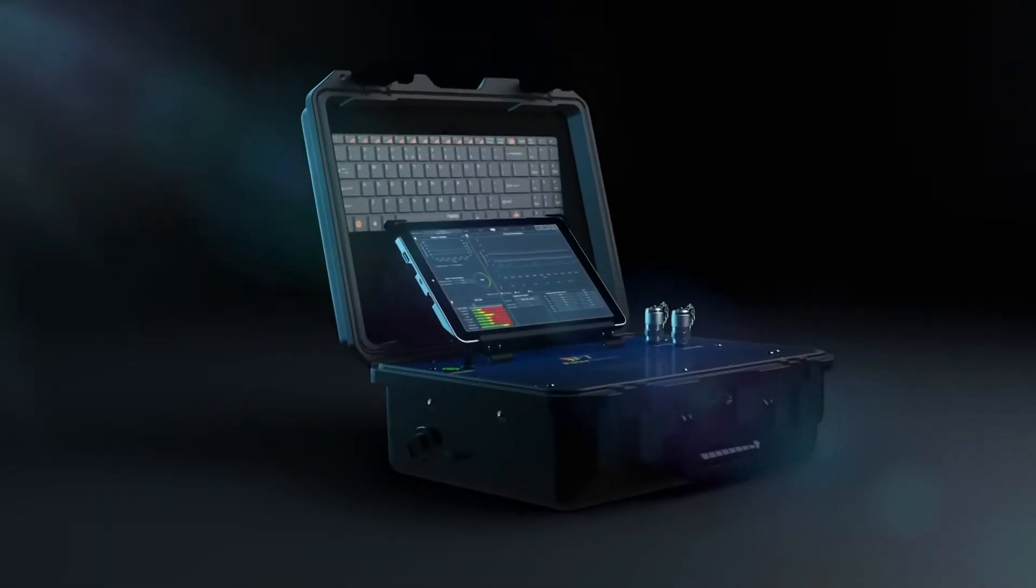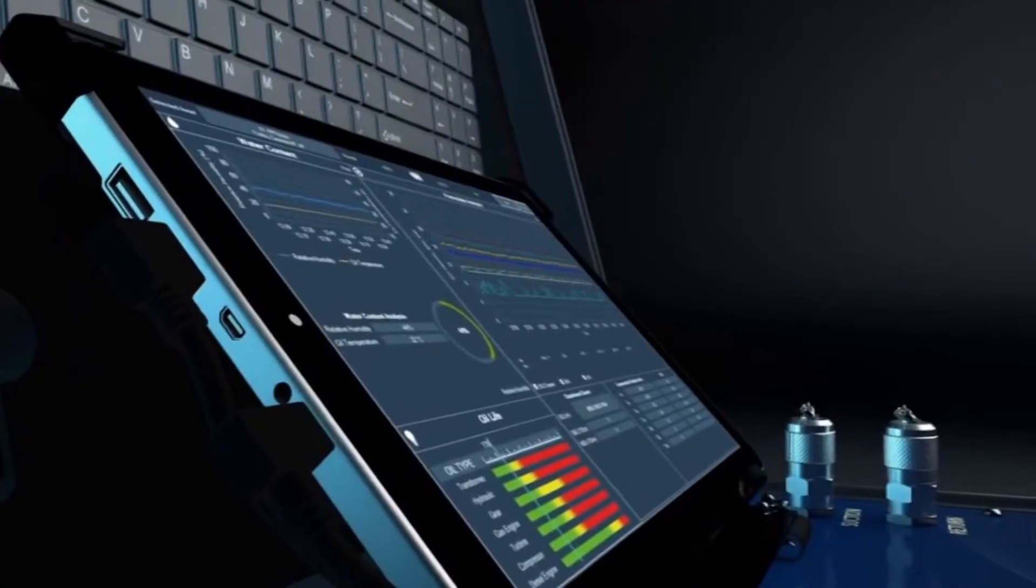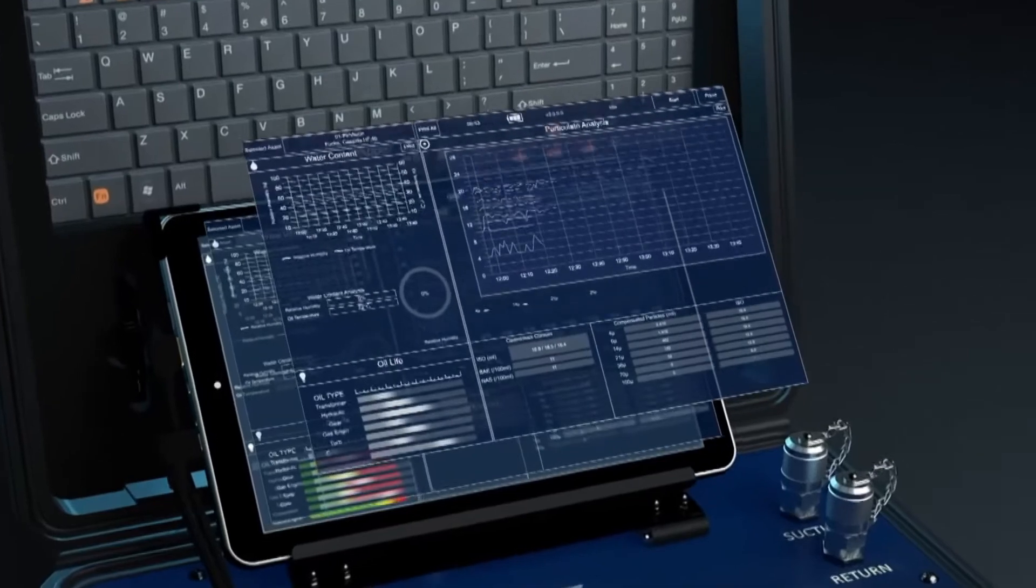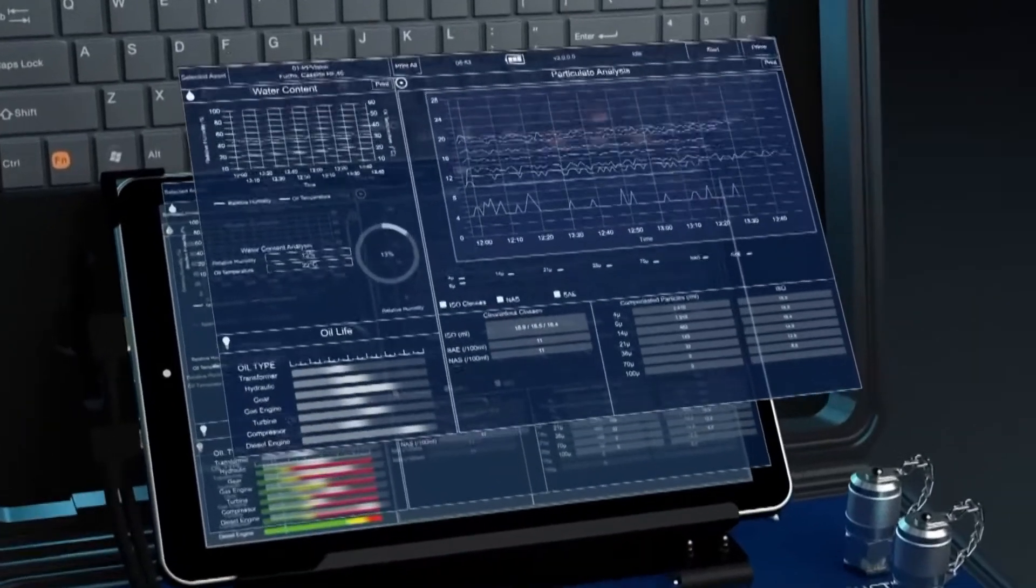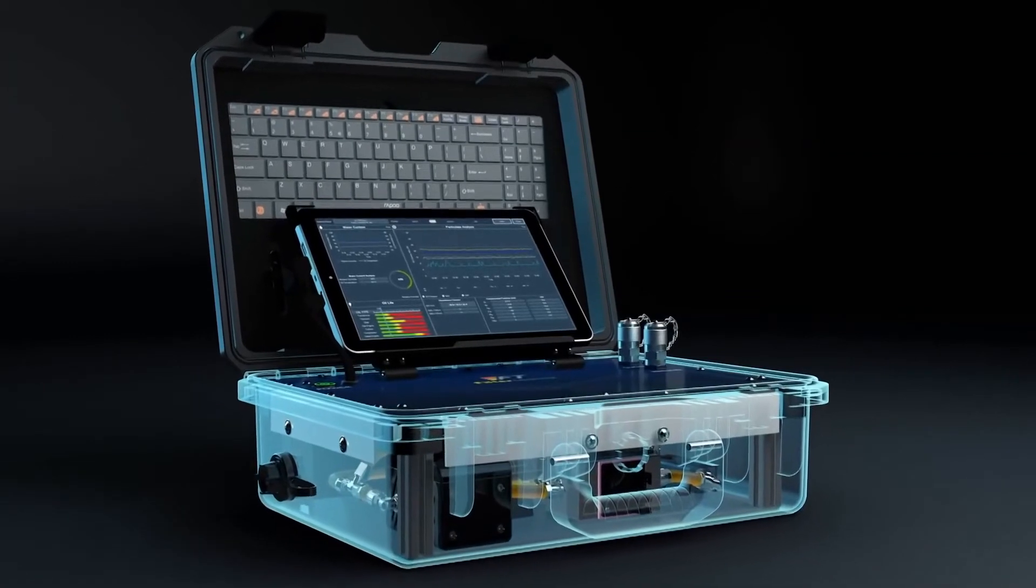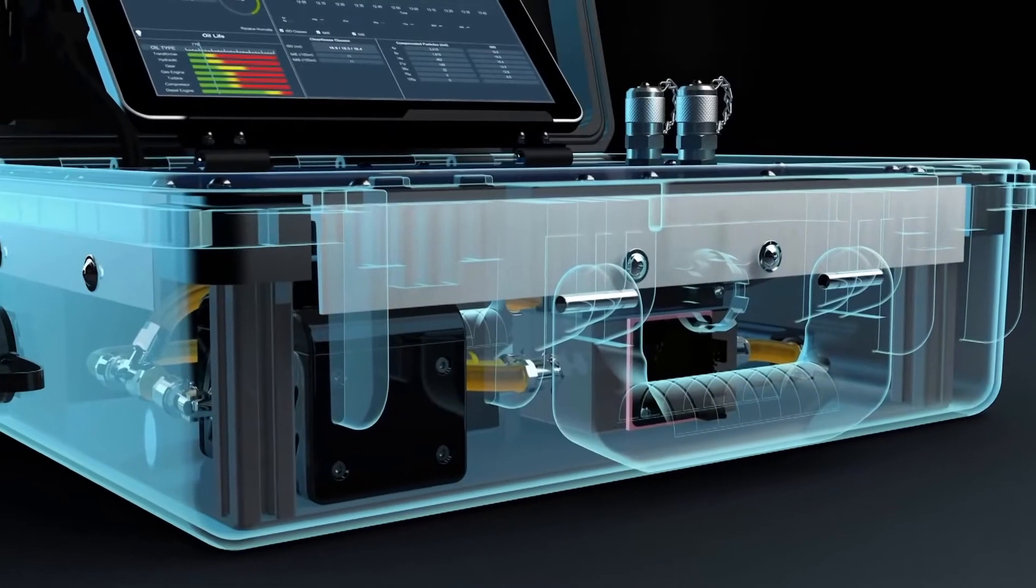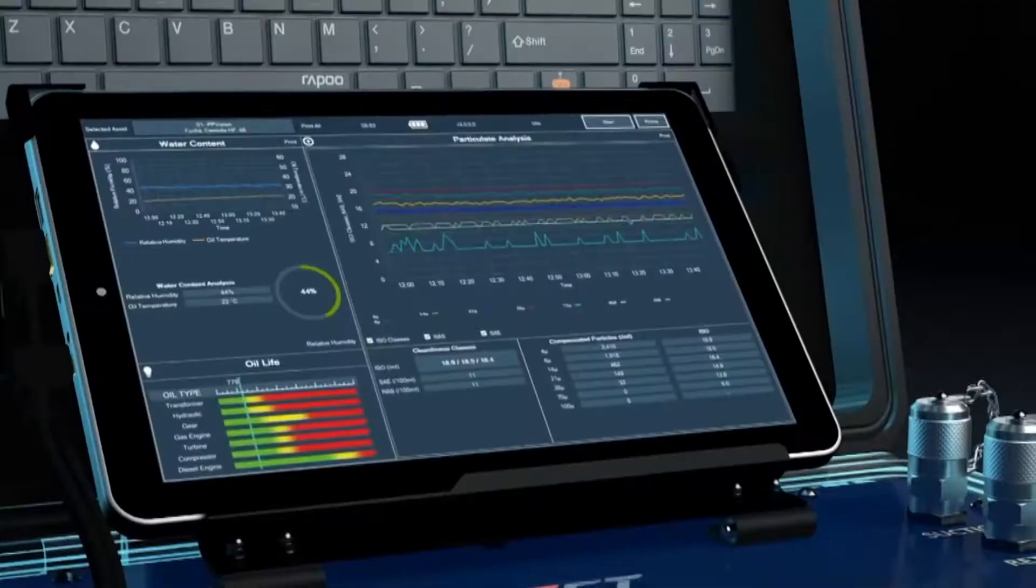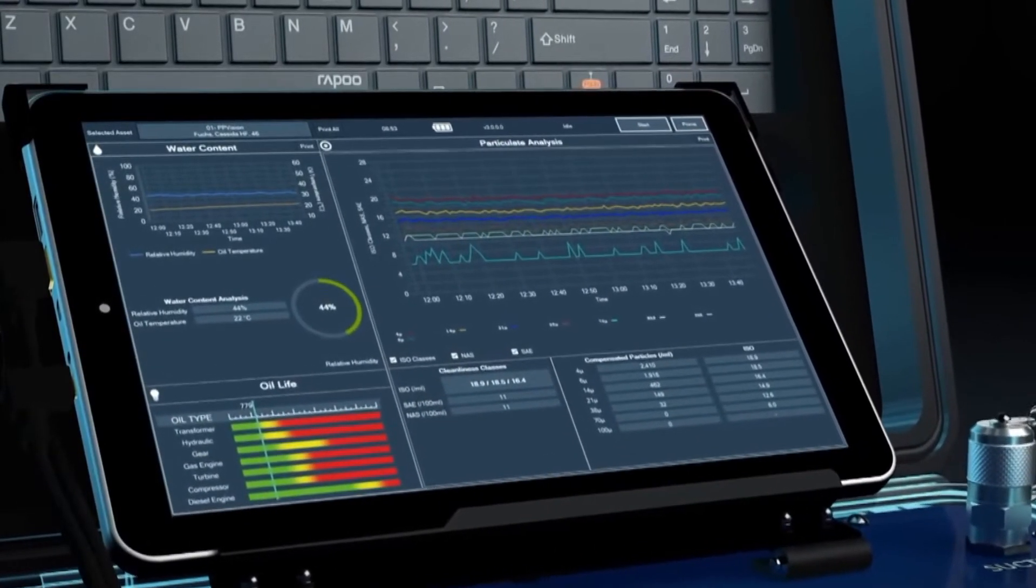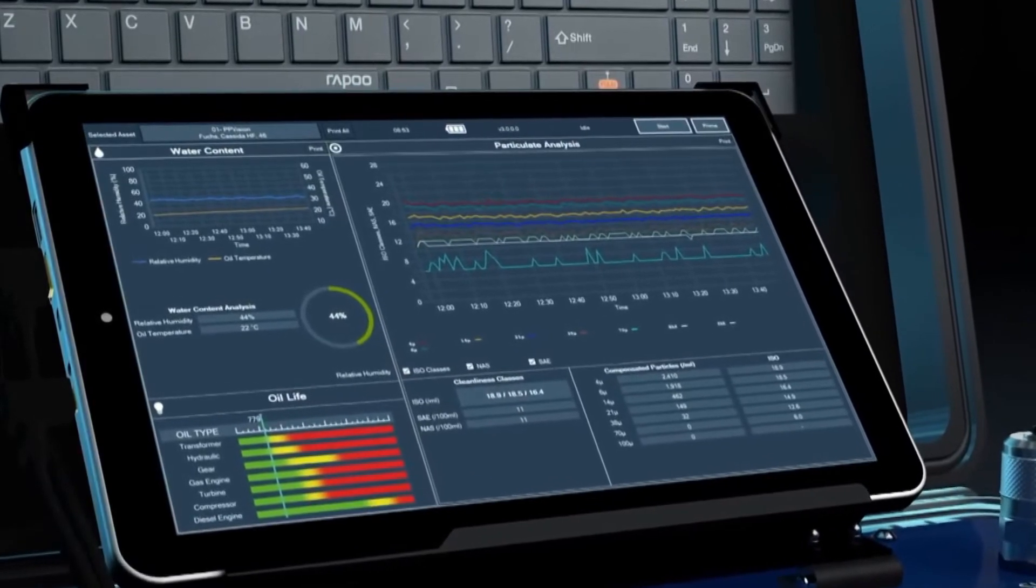A significant breakthrough in next-generation portable on-site oil analysis. High-resolution digital imaging enables greater insight into the size and shape of particulate in any oil system, regardless of oil type or viscosity. Remaining oil life and water content sensors deliver on-the-spot oil analysis data for greater assurance and insight.